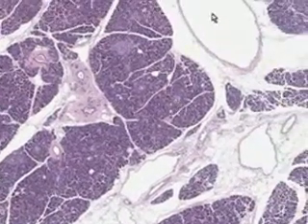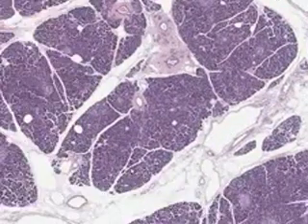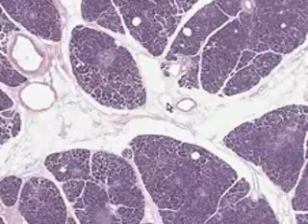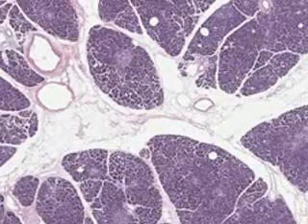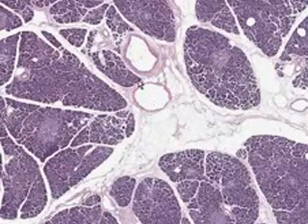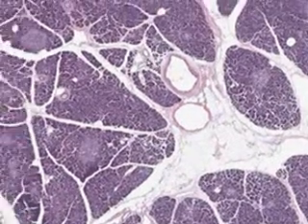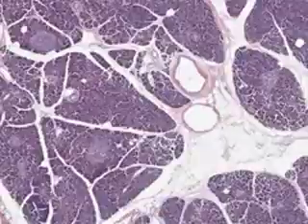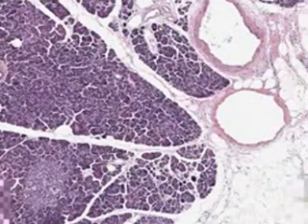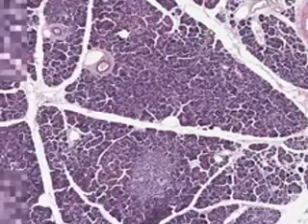Notice we have a large vein here, a large vein here, a large vein here, a beautiful vein next to a beautiful artery here, and probably a vein here, an artery or a duct here, and a couple of veins here. I think this may very well be a duct because it looks like it has some epithelium, so let's prove it. No, it's an artery. Artery, vein, vein, maybe an artery there.